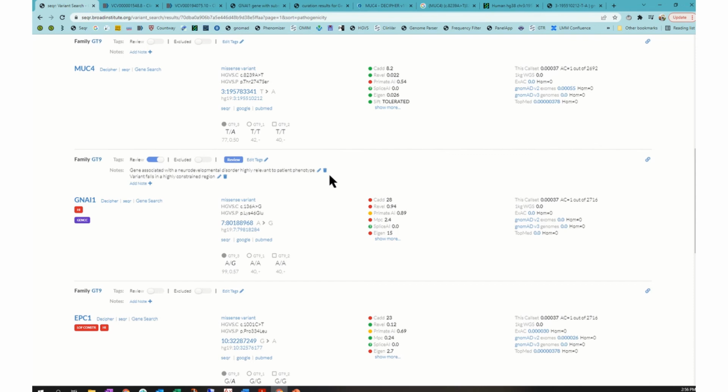There's actually a button you can select on the family page where you just check any variants that have been tagged for review, and they will be submitted along with any structured phenotype data provided for the patient, and it even enables automatically generated emails to any potential hits that come out of Matchmaker. So just so you are aware, that is a nice feature of seqr. Not enabled in these projects, but there will be a session later on in the workshop about doing Matchmaker Exchange submissions through GeneMatcher.